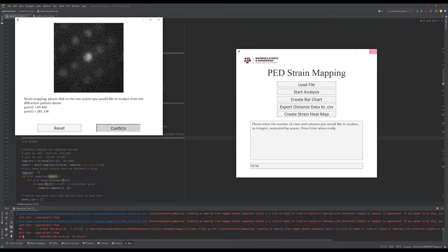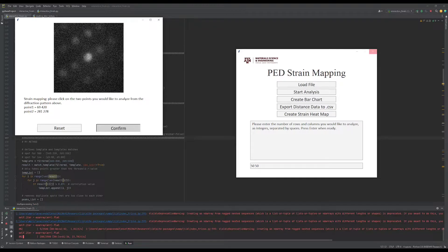There will be a progress bar displayed in the terminal which will show the current percentage and estimated time till completion.